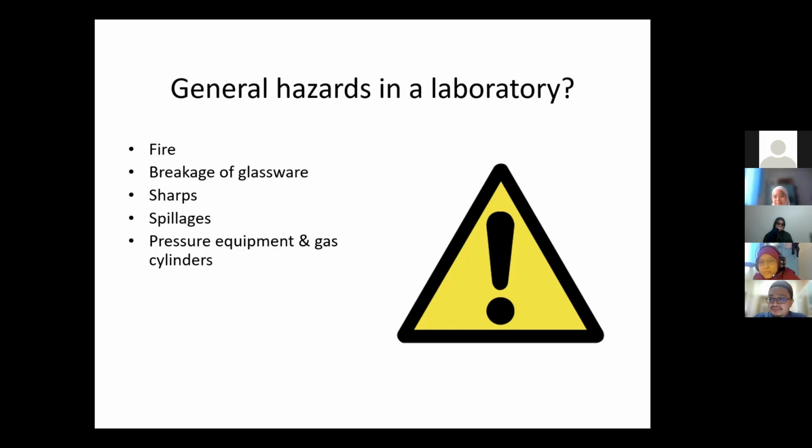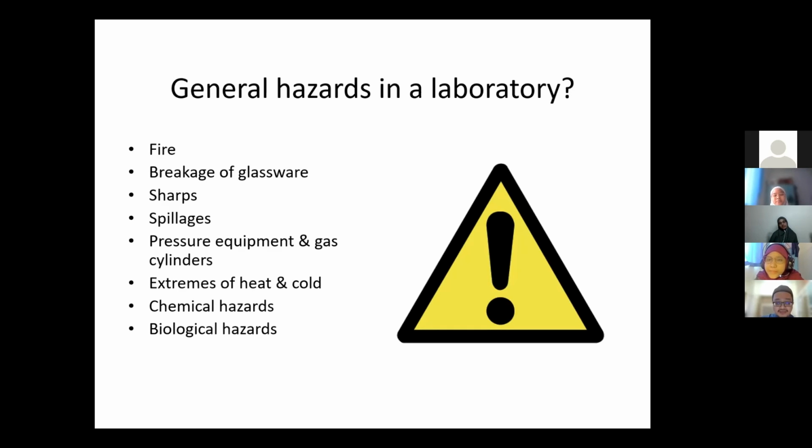What's the consequences of that? Some students, including mine, tak boleh nak buat kerja. My student, for example, dia drop from her master's course, terus tak jadi buat master's. Okay. Anything else? Extreme heat and cold, chemical hazards, biological hazards, radiation. So quite a lot of hazards in the lab. Not the safest place on earth.